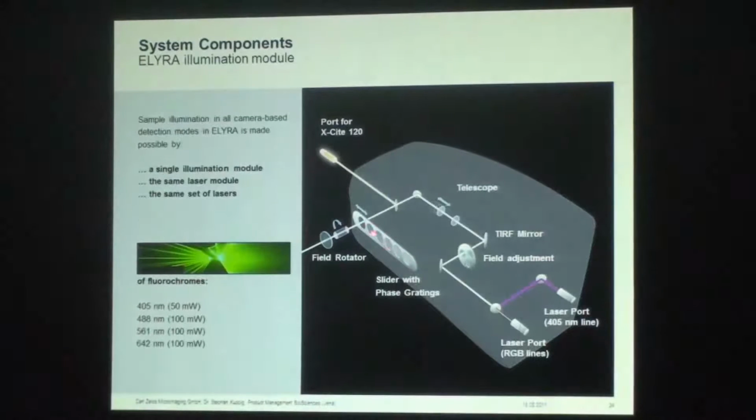When you move the specific grating, as you know, we have options from 0.28 micron to 0.35 micron grid spacings available in the pattern. This depends on the fact that, although we use only one lens, different grid spacing is needed for different wavelengths of light, because the resolution decreases with increasing wavelength, so you have to use a higher grid spacing with increasing wavelength.